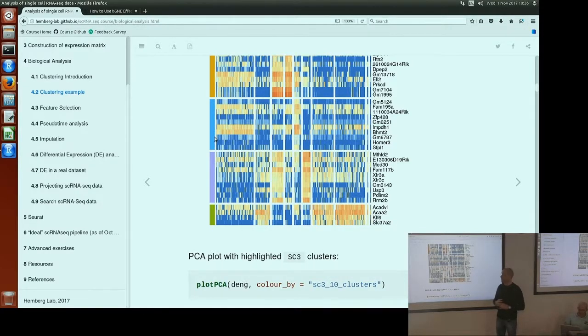You can have a look. So it will use this column to plot these gene names on this graph. If you don't have it, then it will probably use the row names of your rowData slot. Sometimes these can be Ensembl IDs, which don't make sense on the plot, so they will not tell you much.